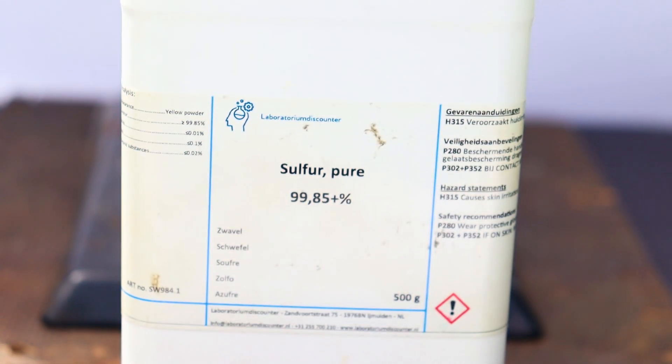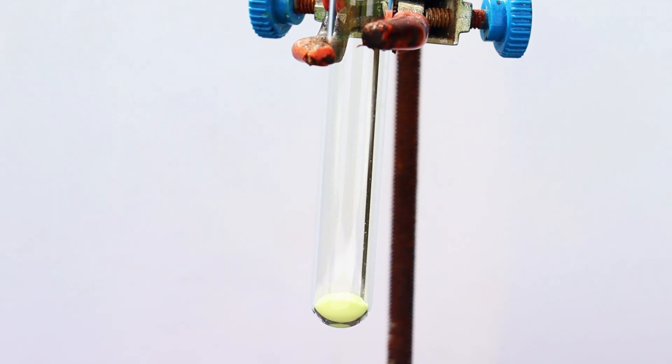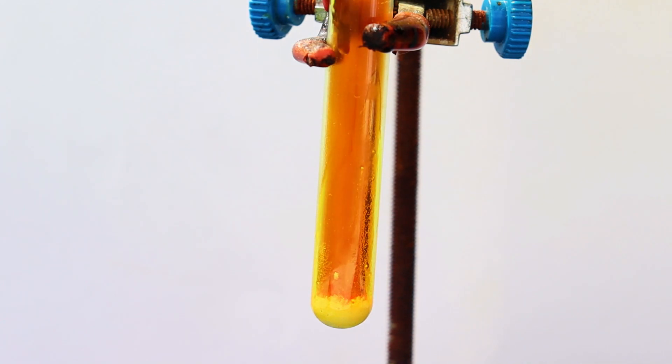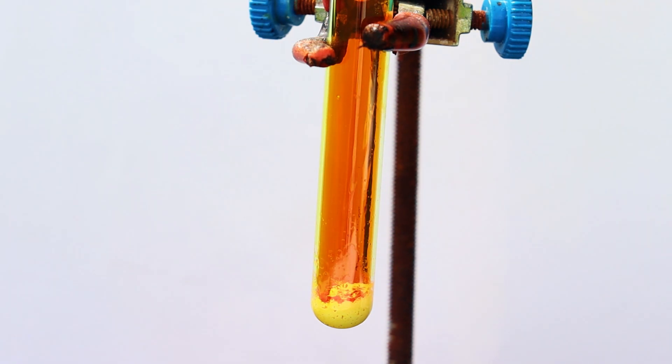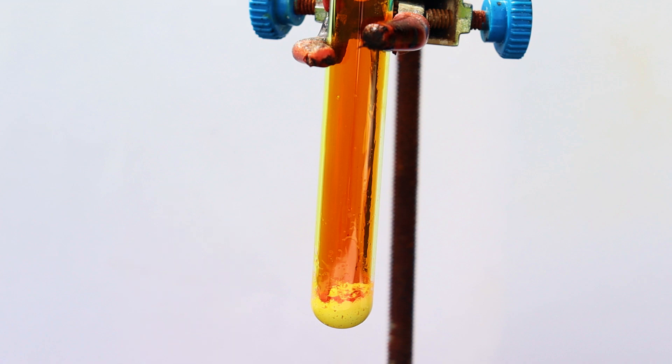Okay, moving on to the next experiment, this time with sulfur. Immediately upon addition, a whole lot of red nitrogen dioxide was formed, and the reaction was quite vigorous. I think that the products of this reaction were mostly sulfur dioxide, nitrogen oxides, and water, as well as some sulfuric acid. But I was very surprised with the fact that the reaction was so vigorous.